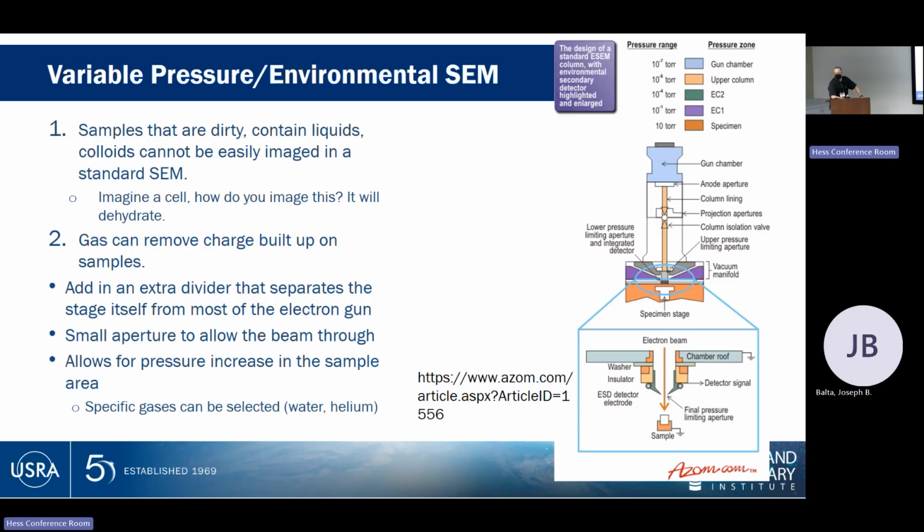That could be imaging a chemical reaction. That could be imaging something that's going to dry out. If I don't pull a full vacuum in my SEM, I leave some additional gas in there. That gas can remove some of the charge. It will not necessarily remove it all, but it can remove some.